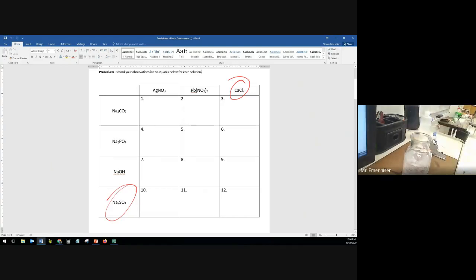Let's actually pour the water off and see if we can see the solid a little up closer. I need a funnel. Right? Maybe I don't need a funnel. Whoa, now we're getting some solids in there. Did y'all see that? So this is precipitating with other stuff, which is cool. It's always fun to just pour all the stuff together and see what nasty mess we can make.